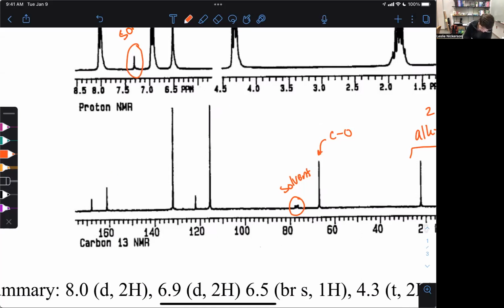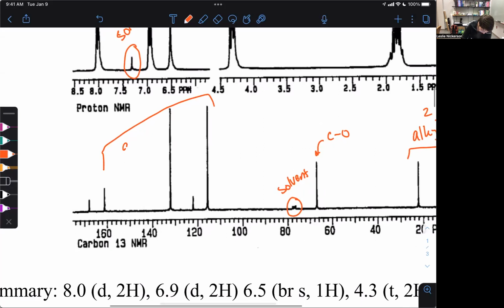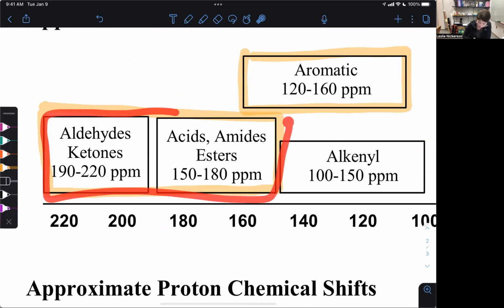So this does take some practice, but if you think about this and the fact that yes, I do have a benzene most likely, as we've seen a couple times already, the aromatic region being spread around makes sense. And we need at the most 6, but we need at least a few aromatic carbons. Alrighty, so then we have our last section, which is our carbonyl section.